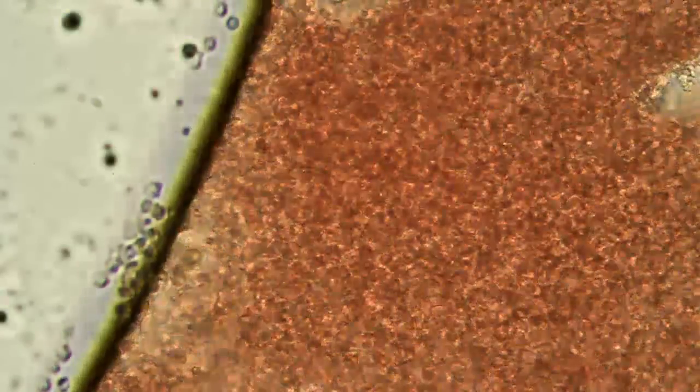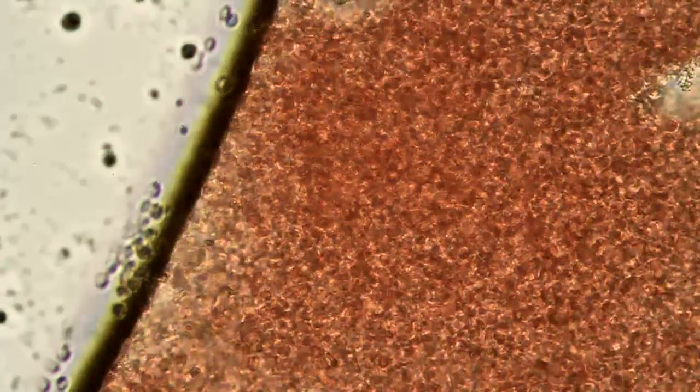Notice here on the edge of this bubble, there's still a lot of activity in the cells.